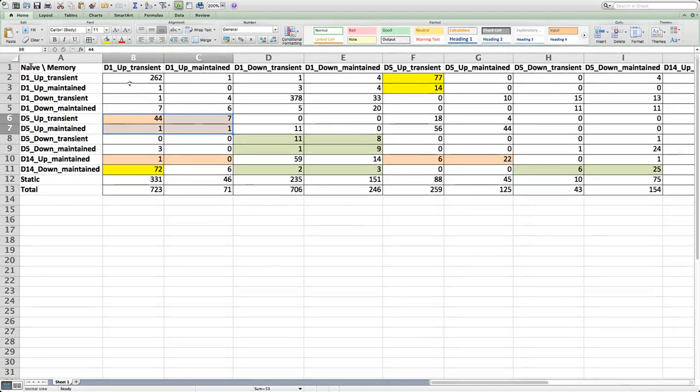But what I did to generate this was I used limma to do a linear model fit, and I tested each pair of time points for differential expression using a log fold change threshold of, it had to be either 1.2 fold up or 1.2 fold down. And so then I got a table of, so between 4 time points there's 6 possible pairs, right? So 6 possible contrasts.